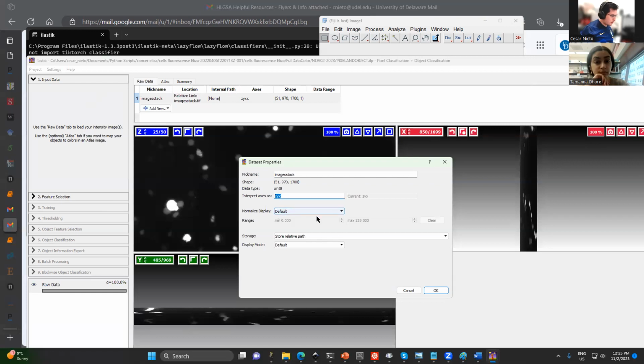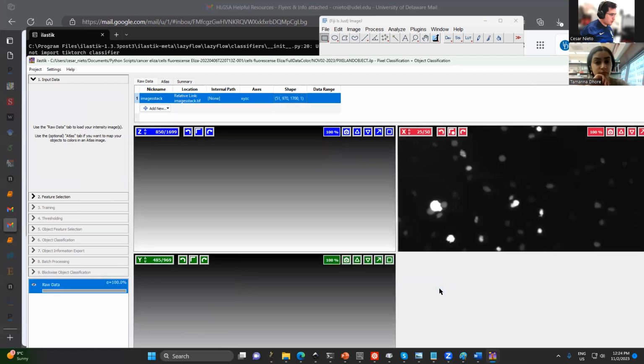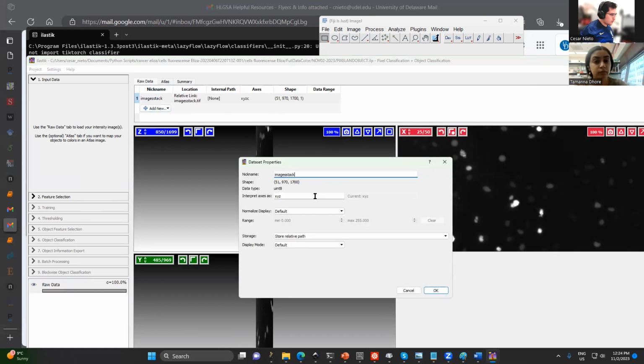This. So the shape is time, no? In the first.